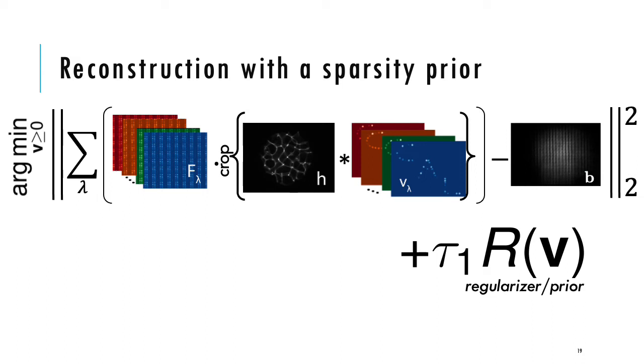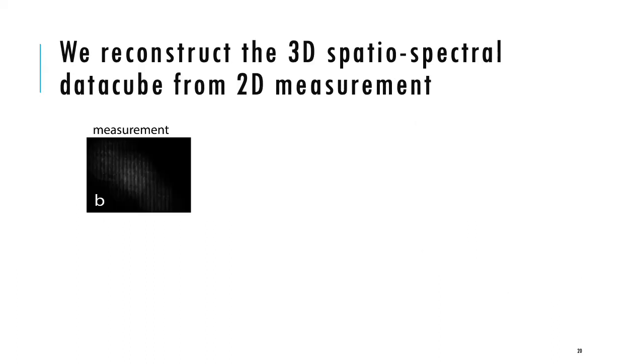We do this by solving a compressive sensing-based optimization problem consisting of two components: the data fidelity term shown on top that decreases measurement error, and a regularizer shown on the bottom that encourages sparsity. Given certain conditions on the scene's sparsity and the incoherence of the measurement system, compressive sensing theory provides some guarantees for successful image recovery, despite the fact that this problem is underdetermined.